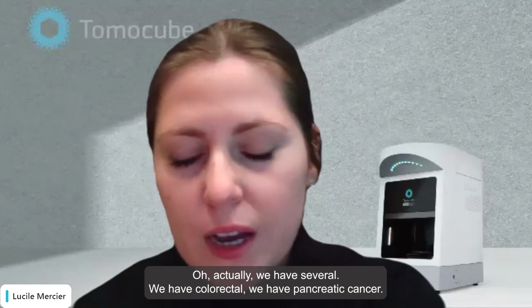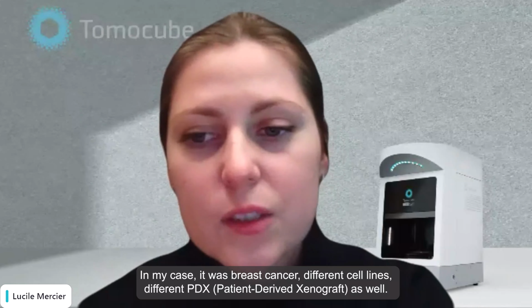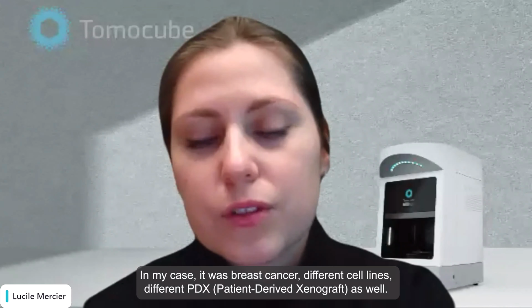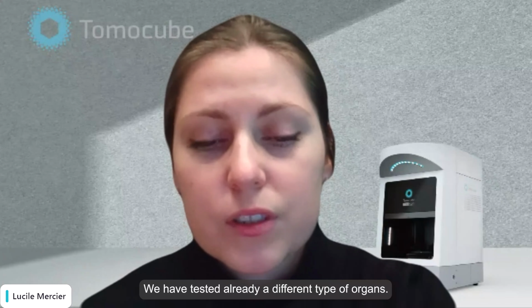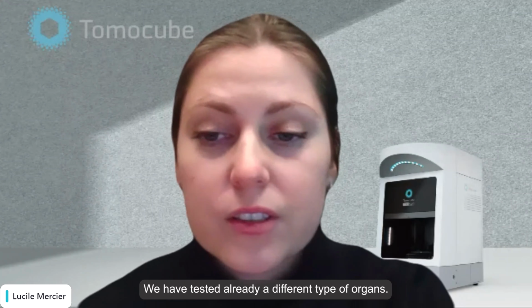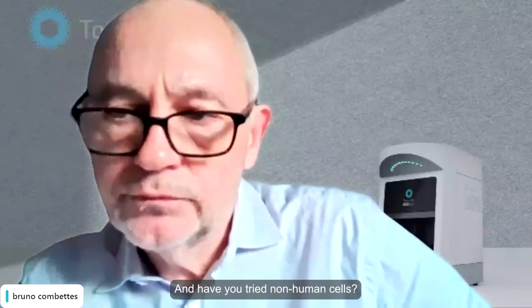We have colorectal, we have pancreatic cancer. So in my case, it was breast cancer, different cell lines, different PDX as well. So we have tested already different types of organs. And have you tried non-human cells?